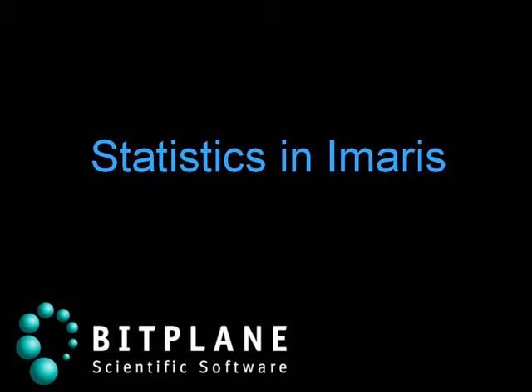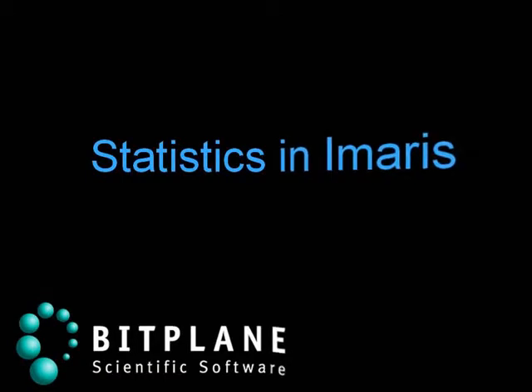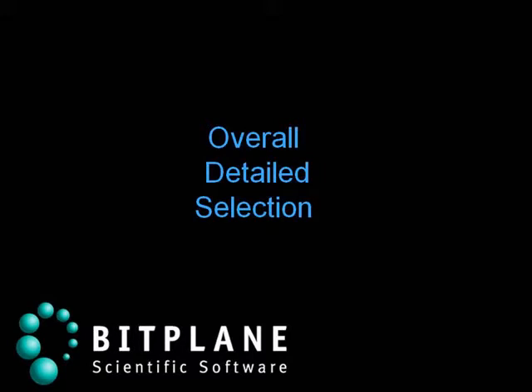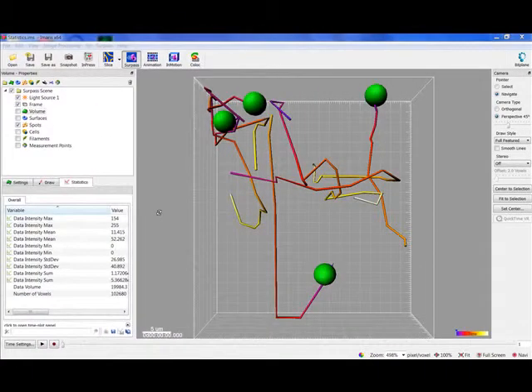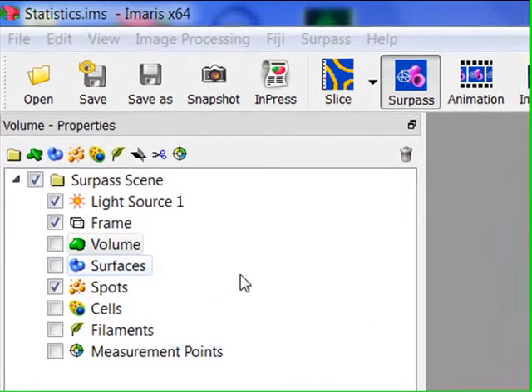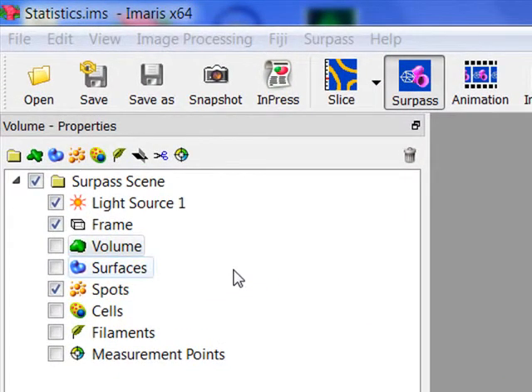This tutorial describes how Imaris displays and exports the calculated statistics, and illustrates the direct two-way link between the Imaris 3D, 4D environment and the statistical output. The statistical values enable us to understand and compare different datasets through summarized numerical values. All the objects you create in Imaris (volume, surfaces, spots, cells, filaments, and measurement points) have their own statistical values calculated.